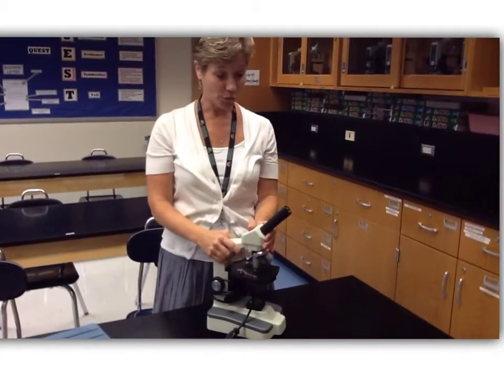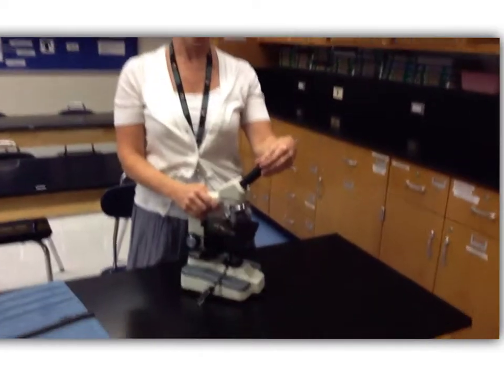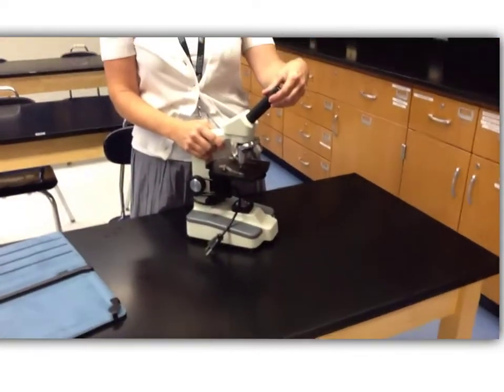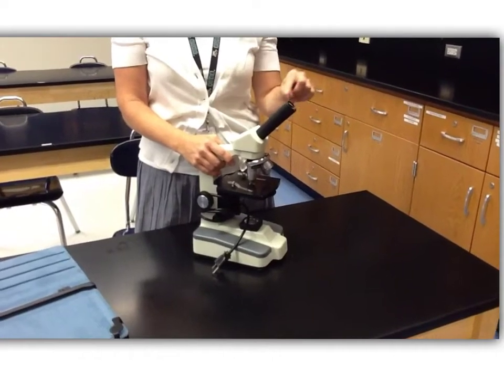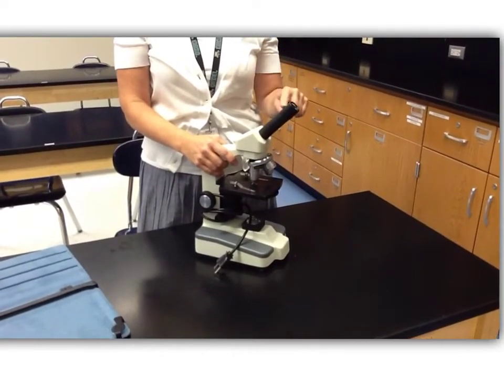There are several parts of the microscope that you're going to need to know. The first is up here at the top, it's called the eyepiece, but its official name is the ocular lens, and it has a lens in it that magnifies 10 times.